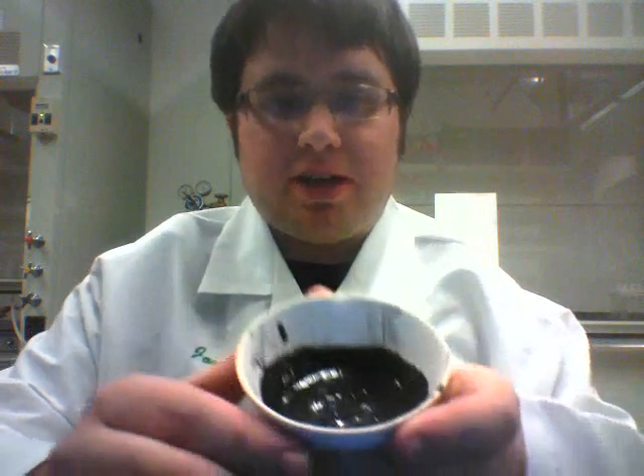One more filtration step, though this time the bismuth is in the residue instead of the filtrate. After everything is done, you're left with this black sludge, which, when dried, gives you bismuth powder.